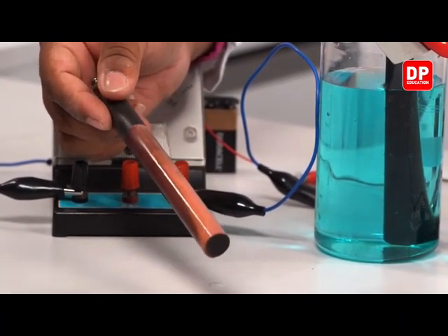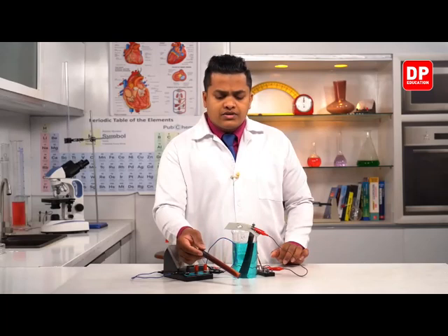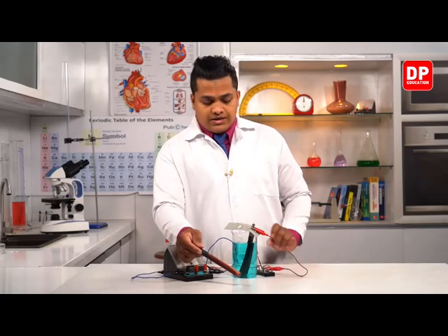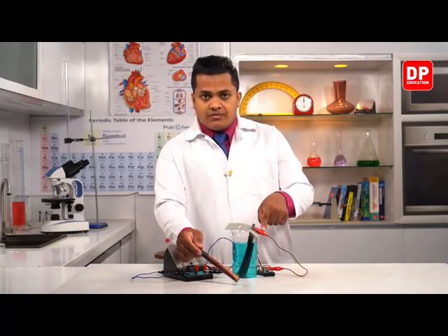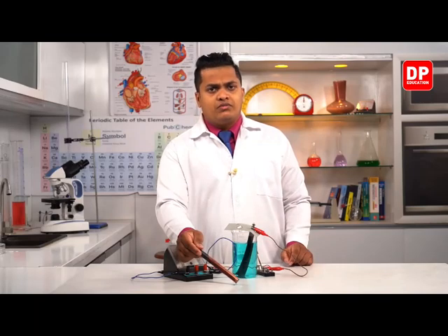By doing this activity, we can finally conclude these are our observations. This is copper metal. Copper is going to deposit on the negative terminal. The color of the solution has dramatically been reduced. And the positive terminal is going to emit gas bubbles. So we'll head on to the classroom and write down our observations. Then we'll come to conclusions.